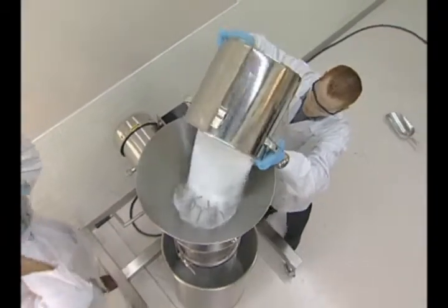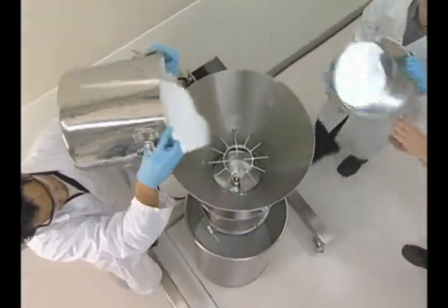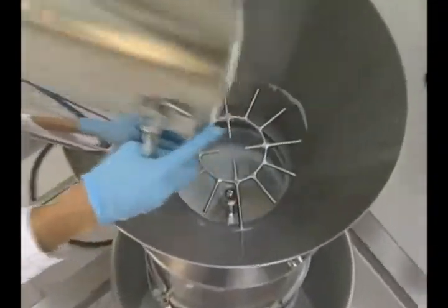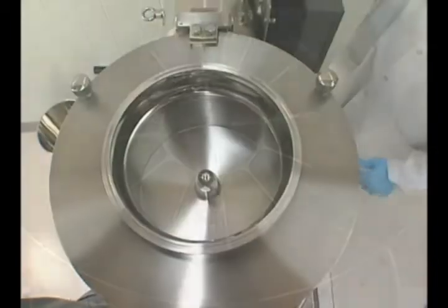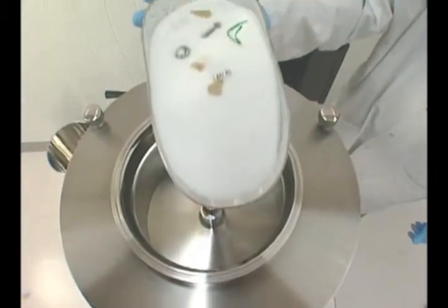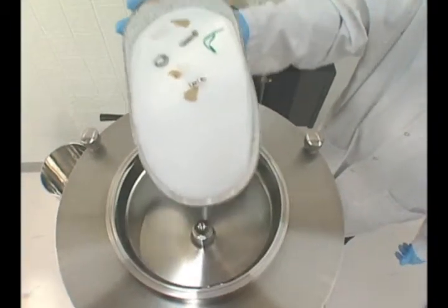Instead, the in-feed product falls into the sifting chamber. The material and impurities are separated by centrifugal acceleration, ensuring a continuous flow of material through the screen openings.